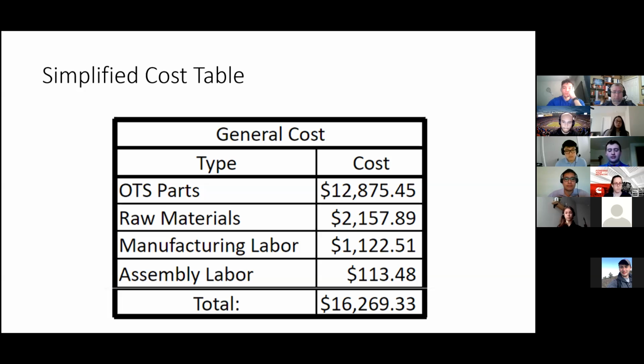If we look at our design as a spatial map of cost density, we find that our off-the-shelf well plate reader, our off-the-shelf well plate thermal shaker, and our liquid handling subsystems are high cost concentrations at around $3,000 each. Our custom parts are primarily made of 316 stainless steel, aluminum, and polystyrene, which we use to arrive at our total raw cost of about $2,000.